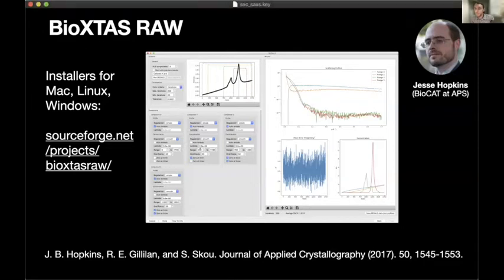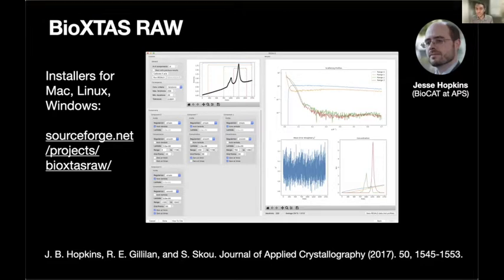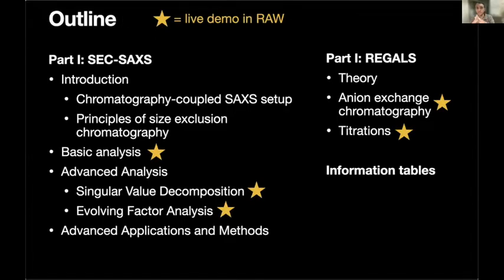So, for the demos, I'm going to show you using RAW. Jesse Hopkins, who's been developing RAW most recently, is a good friend, and anytime we come up with new methods, he makes a nice GUI for it. So I'll be demoing some of those. And hopefully you've all downloaded RAW already, and you can try these. All these data sets that I'll show you are part of the RAW tutorial, so you can play with them yourself.